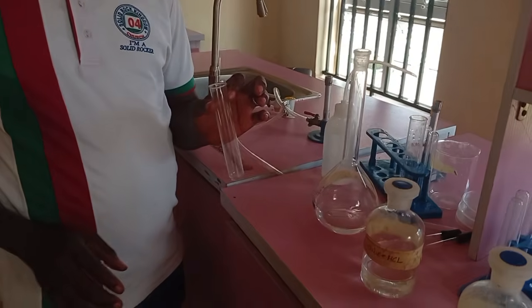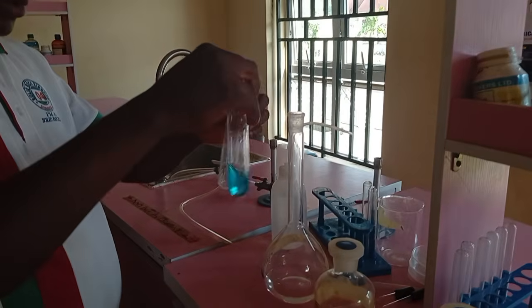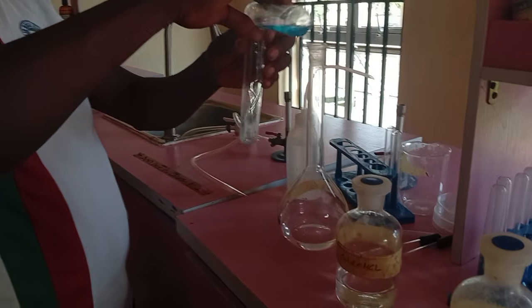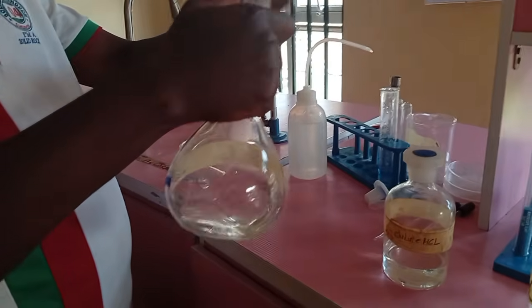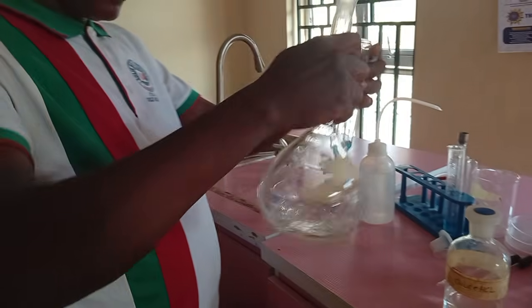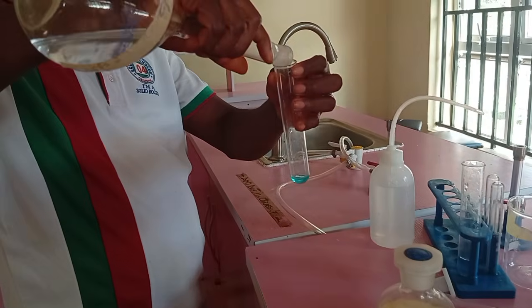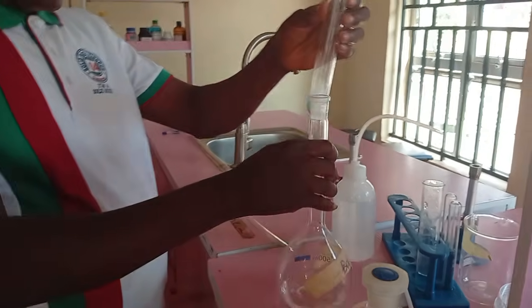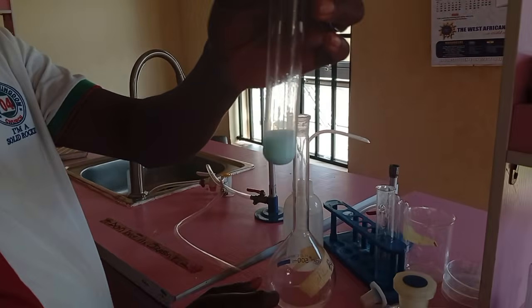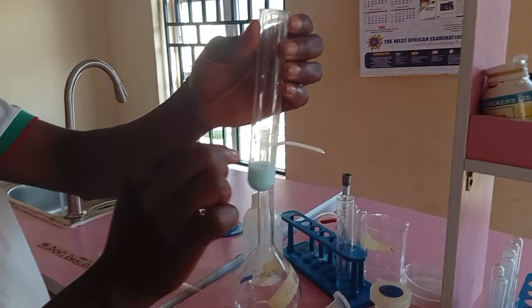Okay, on the third portion, this is copper sulfate solution. We put some sample here. Then we add barium chloride. This is barium chloride. We add it here. This is the test for tetraoxosulfate 6 ion. We have a white precipitate formed. This white precipitate is due to the formation of insoluble barium sulfate.